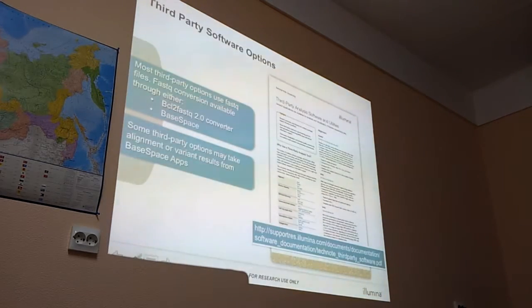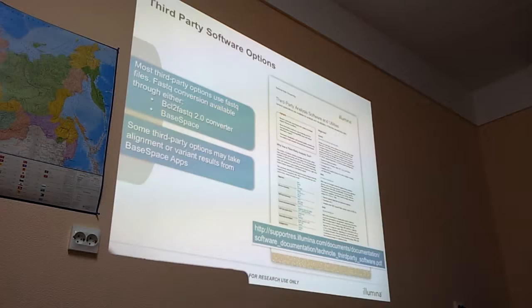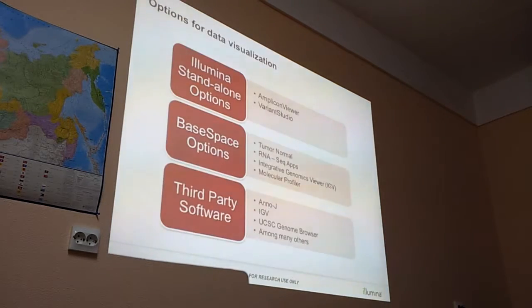And this is also interesting. So we also have some recommendations about third-party software. About visualization, for example, Variant Studio, this Amplicon viewer, to be honest, I think most people don't use, but Variant Studio is quite useful.